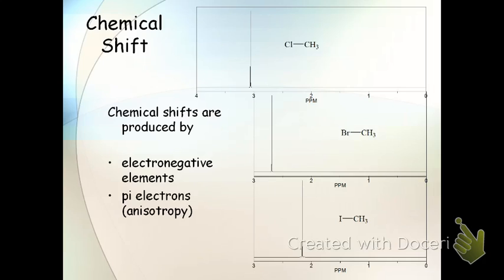A couple other common offsets. These are simulated NMR, so they're a little cleaner and a little more predictable. But just to give you the idea, there was a methyl group. There's a pretty large shift when you have a chlorine on it. It's actually, with 2 chlorines, around 5.5. We very often see methylene chloride in our samples, and it's a peak that shows up way over here somewhere.